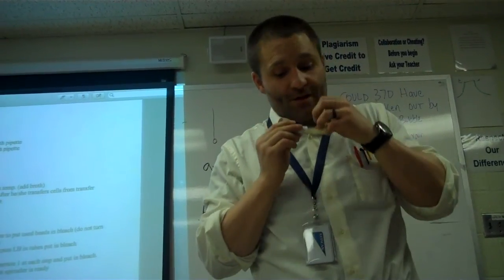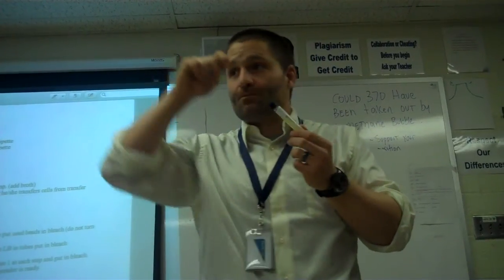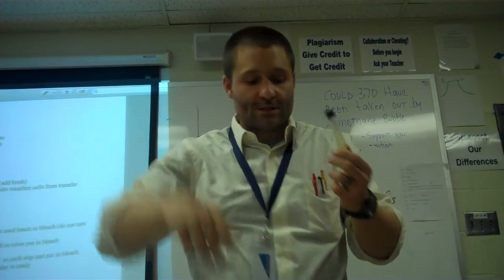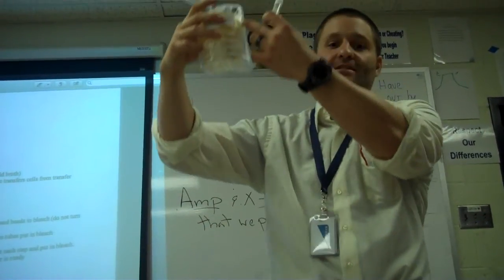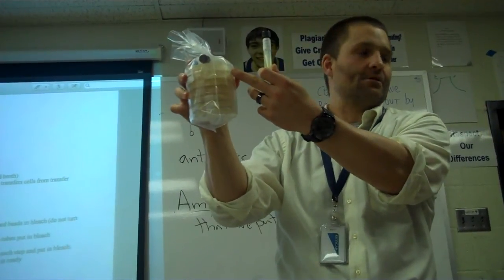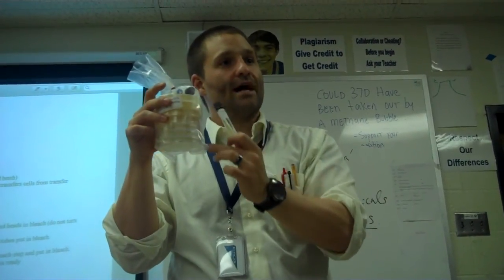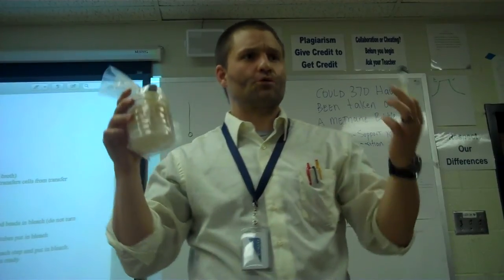But anyway, this is the E. coli, they call it the colony. So I'm going to take from this, the little inoculation loops, those little bitty guys, I'm going to scrape down in there, and I'm going to put that on these plates here. These are the plates that we were talking about. I'm not going to take these out. Then I'm going to grow this strain of E. coli on these plates for you guys. I will get them started for you.